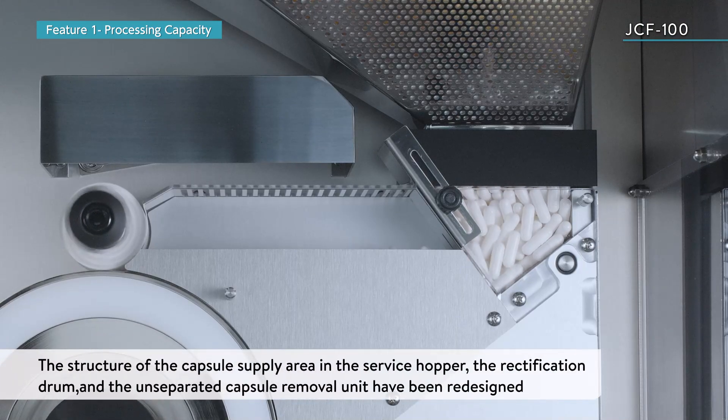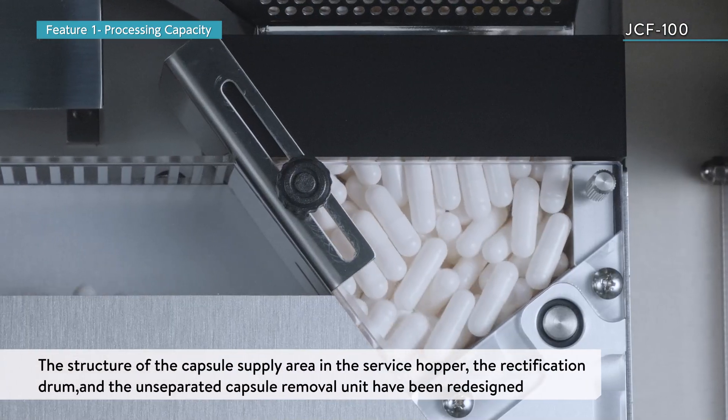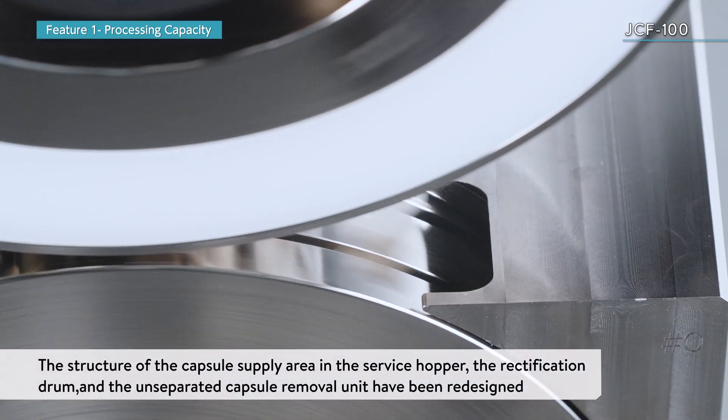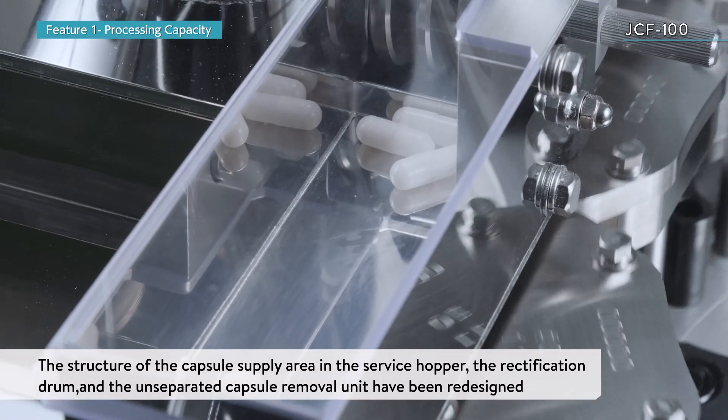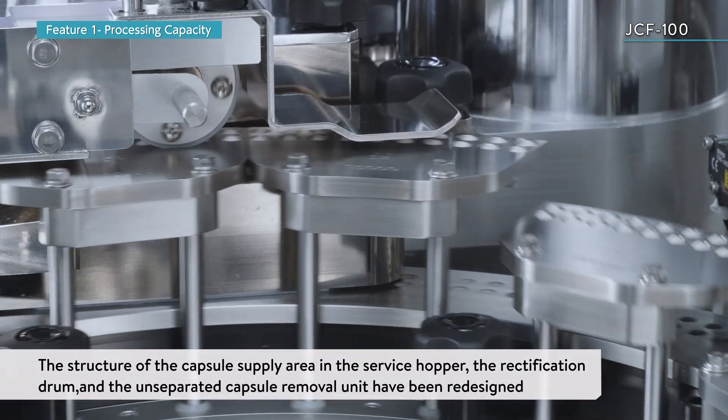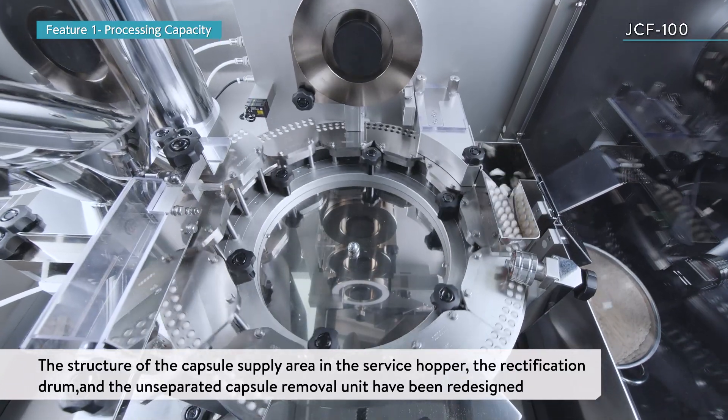In addition, the structure of the capsule supply area in the service hopper, the rectification drum, and the unseparated capsule removal unit have all been redesigned to significantly reduce equipment downtime.